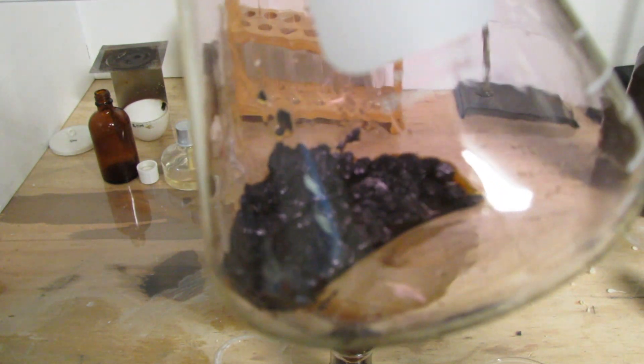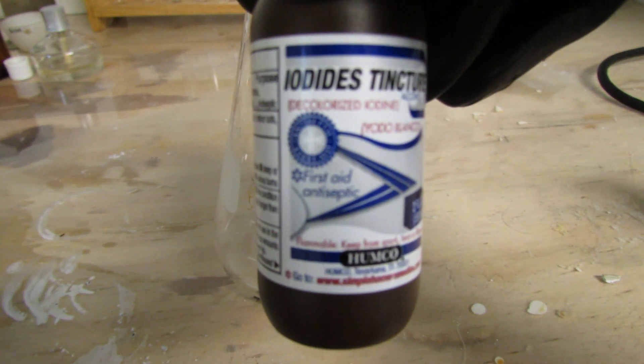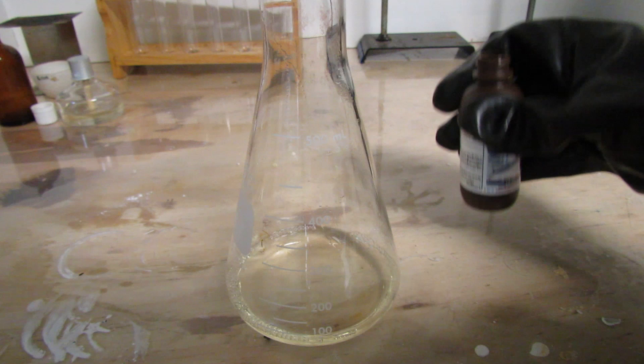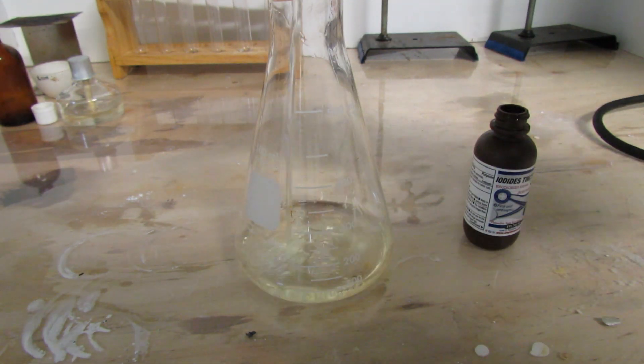Hey guys, this is GooferKingScience and today I'm going to be showing you how to make iodine from tincture of iodine. Tincture of iodine can be found very easily in most pharmacy sections and department stores. The first thing to do is to pour your tincture of iodine into a large flask. I'm using a 500ml flask.